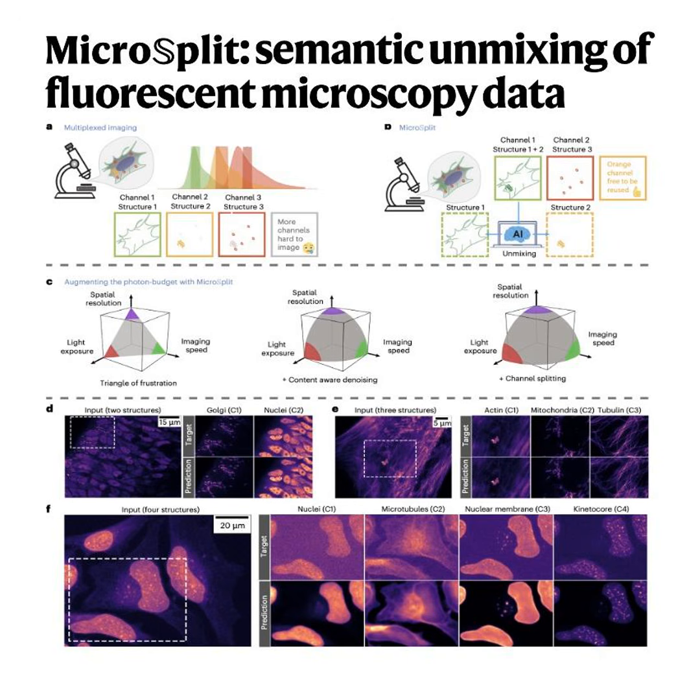If I'm a researcher, why would I use MicroSplit over existing state-of-the-art computational multiplexing tools, like, say, the Picasso system? Well, Picasso is fantastic, but there is a fundamental operational difference. Picasso requires multiple sequential images with known spectral overlaps to calculate its unmixing math. It relies on a stack of input data. Exactly. MicroSplit requires only a single superimposed image.